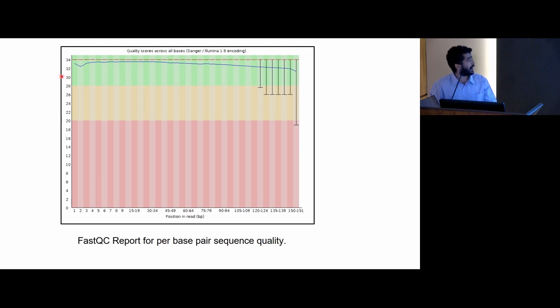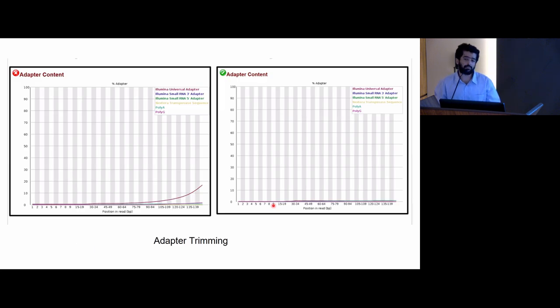Over here, in our lab we keep a bench cutoff of Q30. So Q30 signifies one error in 1000 base pairs, which will be elaborated in the further sessions. Here are the base pair positions, 1 to 151. What we do is we take a cut at around 120. So these are basically your good base quality scores. And ahead, from 130 to 151, is basically your adapter, which will be trimmed out further by using adapter trimming software such as Trimmomatic, Cutadapt or fastp, depending on your assays.